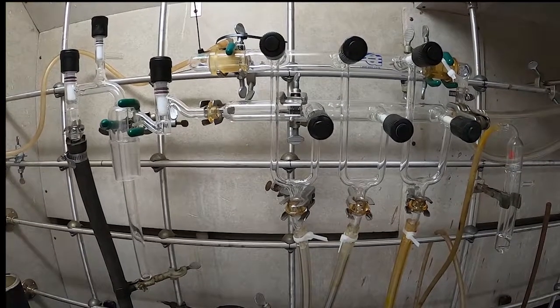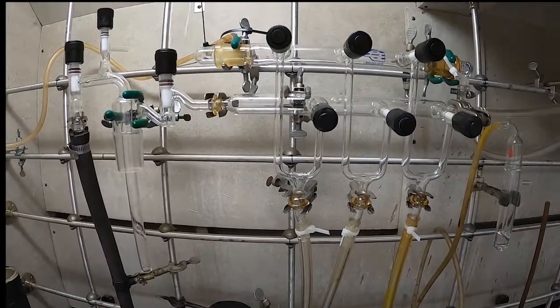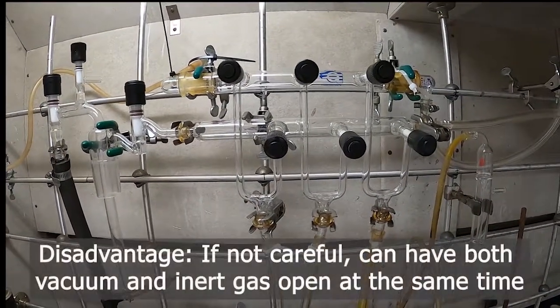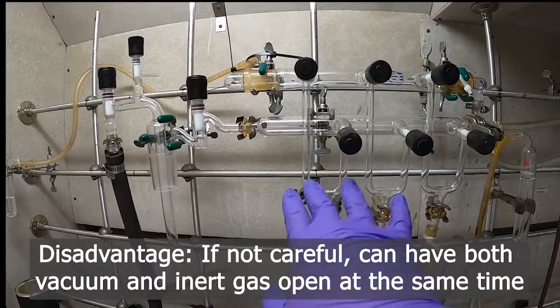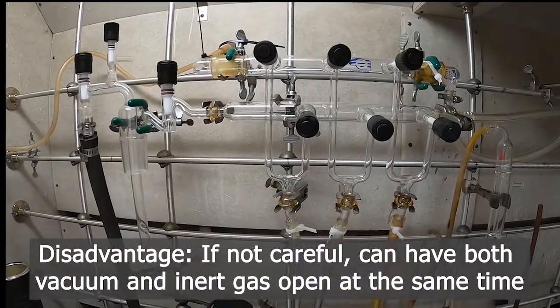They're nice because they're interchangeable, easily replaced, easily clean, but they do allow that vacuum and your inert gas could be on at the same time.